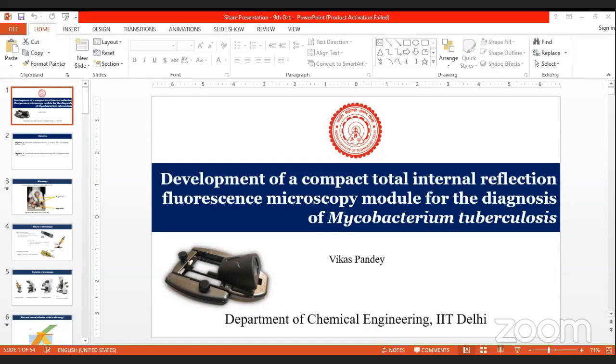Hello, sir. Hello. So my question is, in a normal fluorescent microscope, we use halogen lamps and mercury lamps for illuminating the fluorophores. Here, we are using LEDs. So how far does the sensitivity differ?